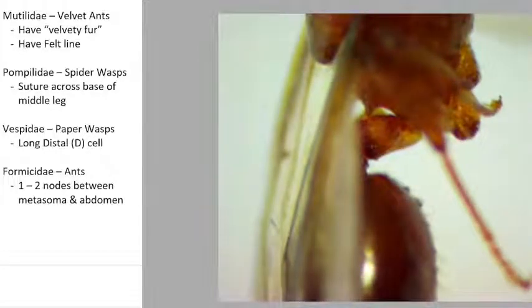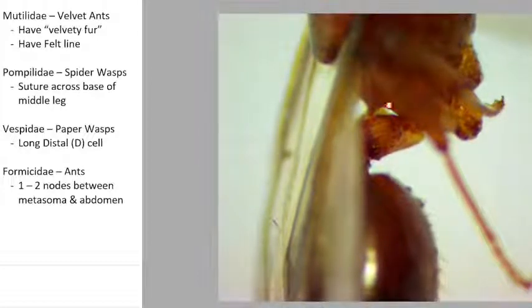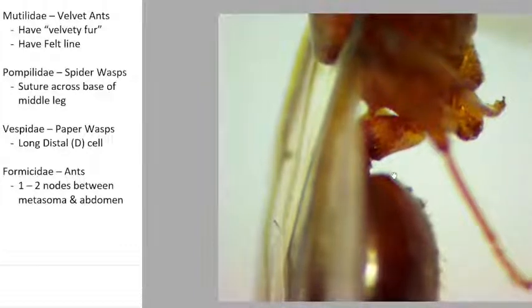I think that first specimen was actually going to be your best way to see it. So you can see how this is the thorax and this is the abdomen. So this is kind of the waist that connects the two. And in ants, they're going to have nodes, these kind of expanded segments in between. Sometimes the nodes butt up right against the abdomen, so they don't look separate, but they always are in ants.